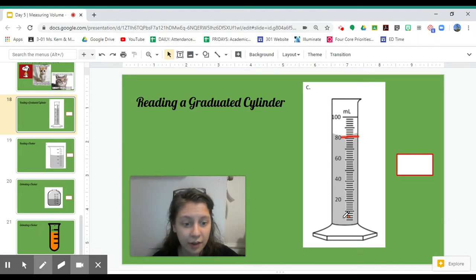If I start at zero down here and go 20, 40, 60, 80, 100, I know between any two labeled numbers there's a jump of 20. I also see that this line is slightly longer between 80 and 100. That tells me this is another benchmark number. The benchmark number between 80 and 100—halfway between that—is 90. So this longer line right here is 90.